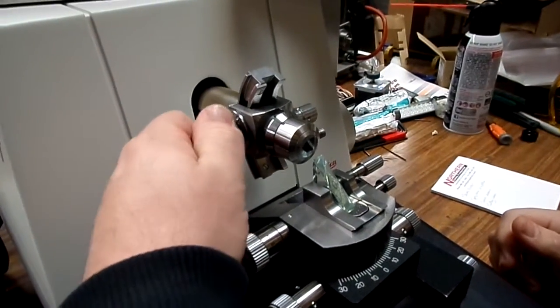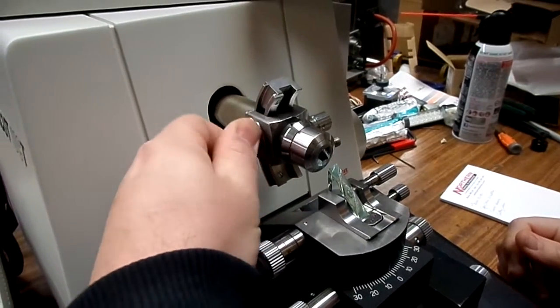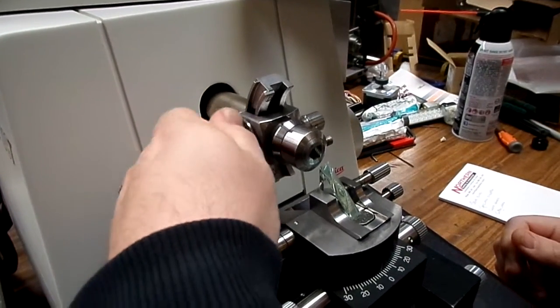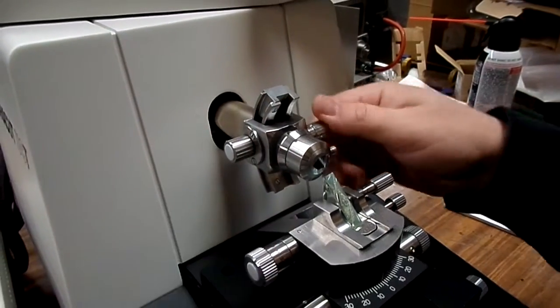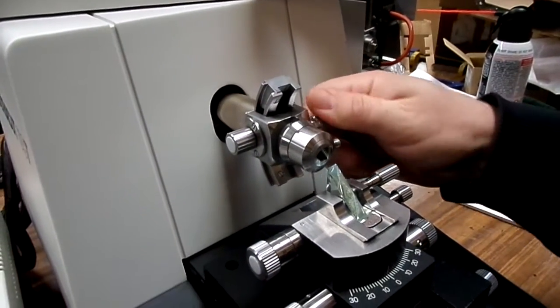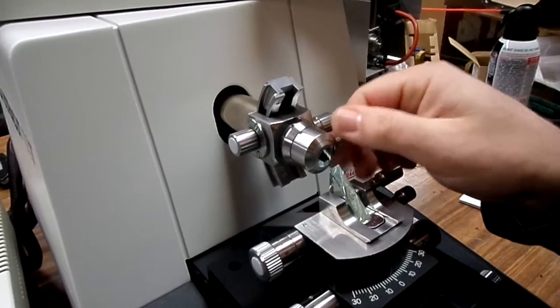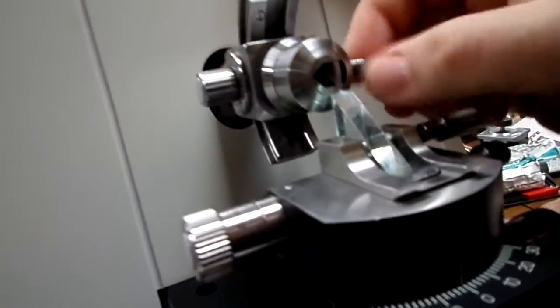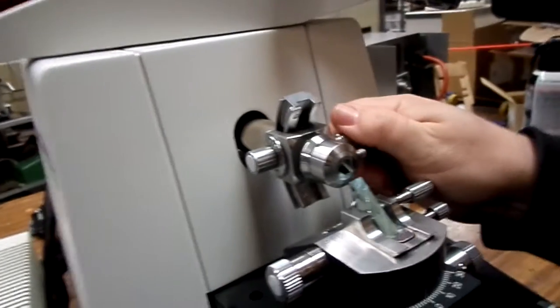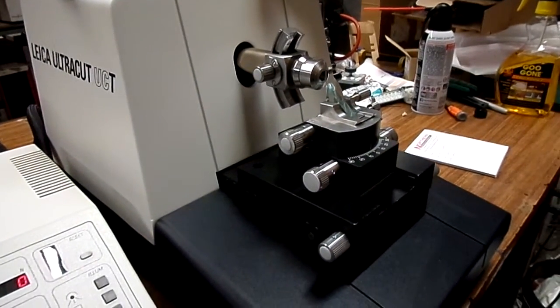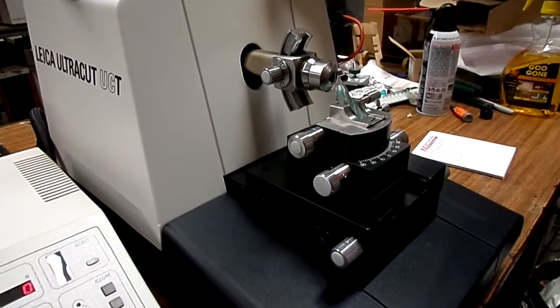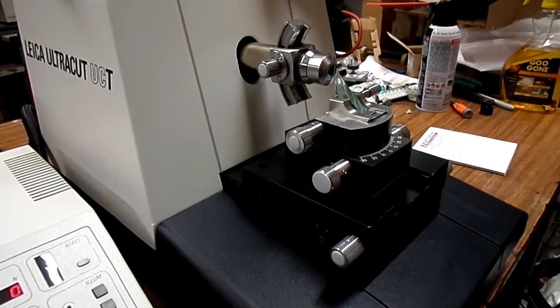Then you have your adjustment on the angle of the specimen clamp. It's pretty self-explanatory. You adjust that. If you want to spin it, you can do it like that. You put your specimen in there, tighten this, and that's it for the adjustment of the specimen clamp and the blade holder on the microtome.